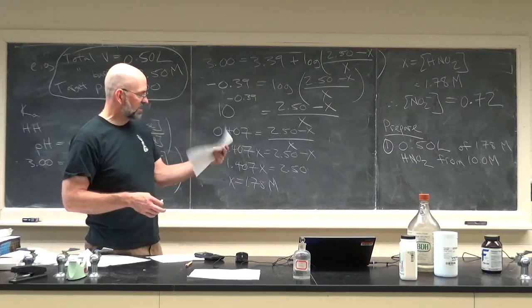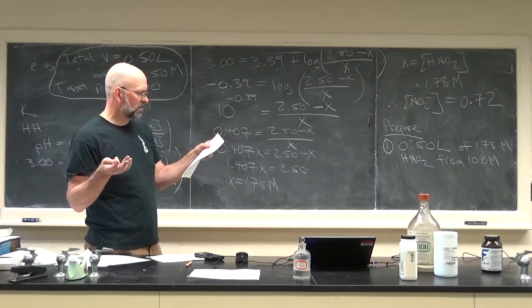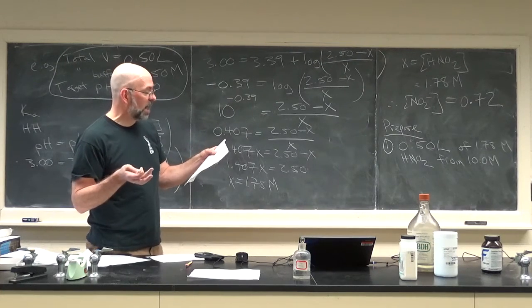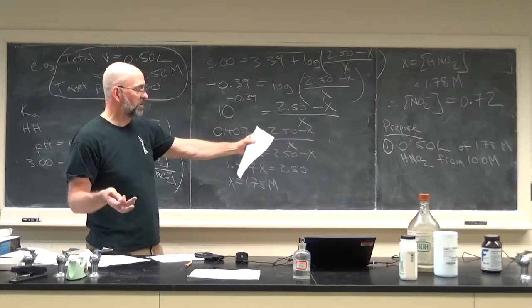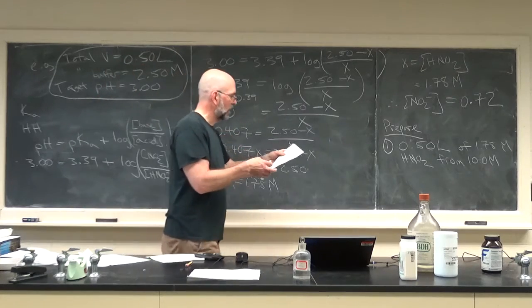Looking on the back side here, it says some acids can be contained in their solid form, blah blah, stock solution. You can determine that you will require 89 milliliters of stock, so 89 mils. So your V1 should be 89 milliliters. So calculate that.